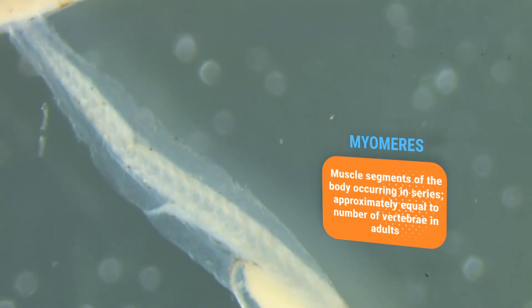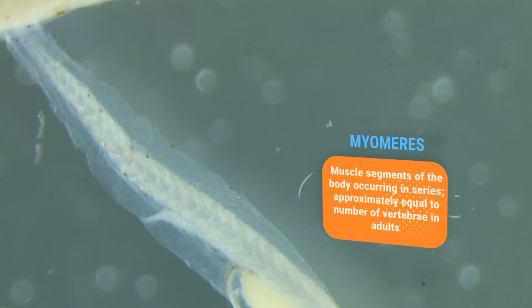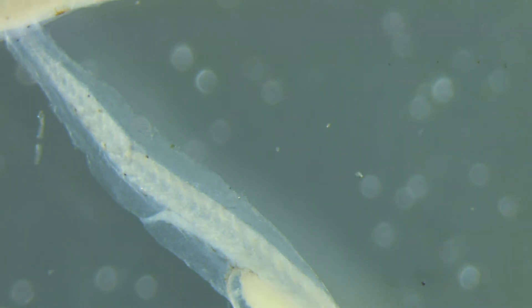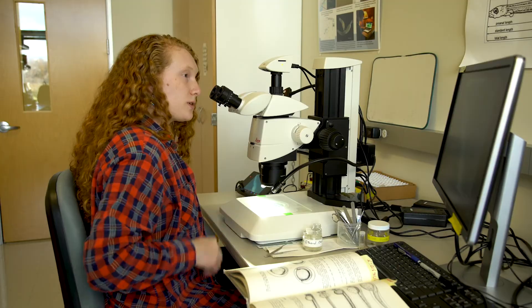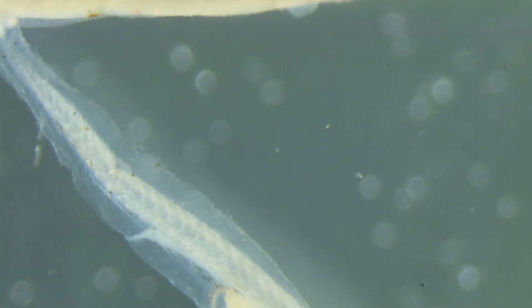So you can see it really well in this little white perch right here. All these little Vs, those are little muscles. And what you do is you count the Vs before and after the vent. Each species has a very specific count. They're all different. So like a white perch has a myomere count before its vent of nine to 11 and after its vent of nine to 11.